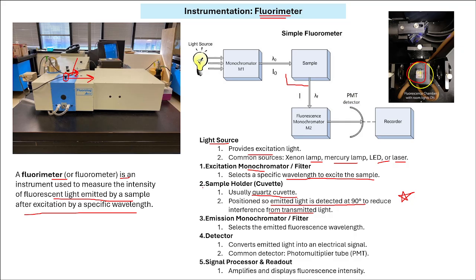If somebody asks you why, in absorption spectroscopy, the light passes straight through the sample and we detect the transmitted light, correlating it with the absorbed light, but in fluorescence, when we are recording fluorimetry, why is there a 90-degree deflection? The answer is that it is positioned at 90 degrees so that the emitted light is detected at 90 degrees to reduce interference from the transmitted light, because there would be too much interference from the transmitted light as well.